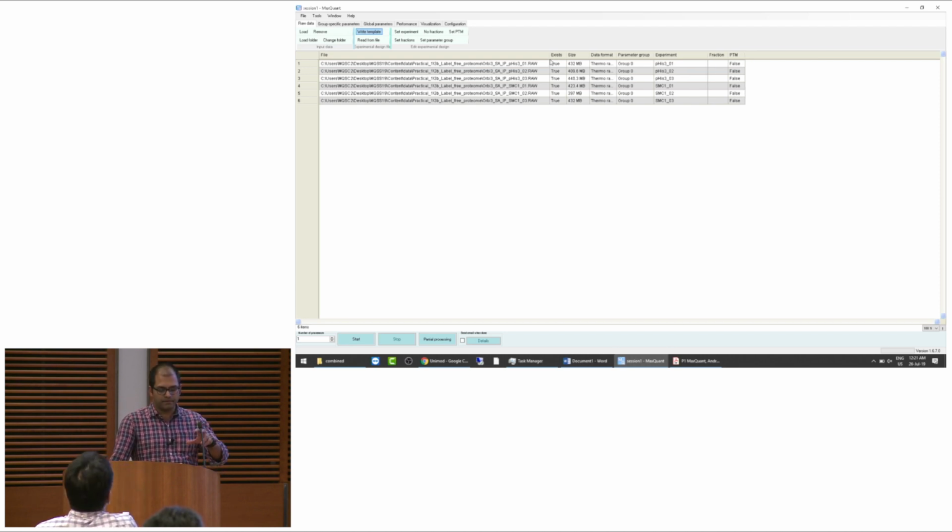So let's say if you have 6 files, let's imagine these are 6 pull downs, and for some reason you want to also analyze the input material of your pull down, the 6 input materials, then that's slightly different, and then maybe you want separate LFQ for them, then that is a separate parameter group. So this is a single experiment where everything belongs to that single parameter group, consisting of many different sets of replicates.